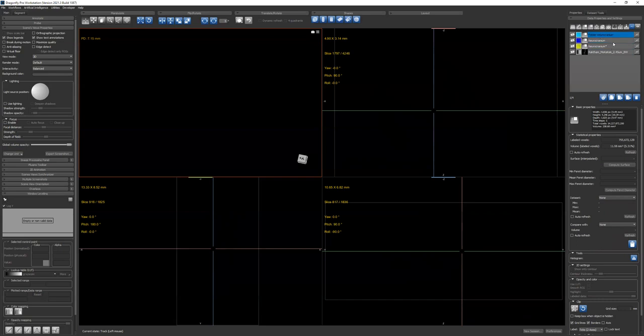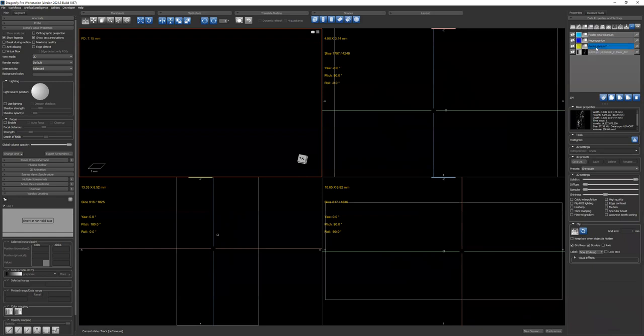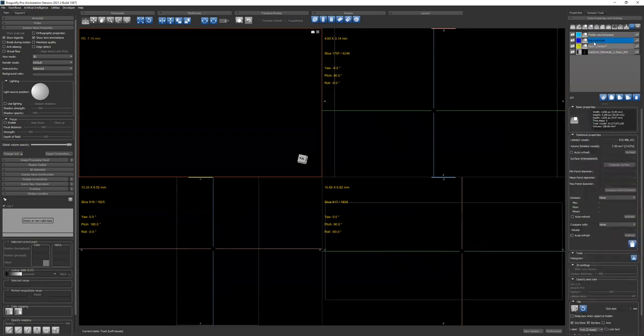So who knows? Anyway, as you work, I would finish one, make this TIF stack, then delete the volume out of there and then save. As I finish another, make a TIF stack, export it, delete that in here, and save.